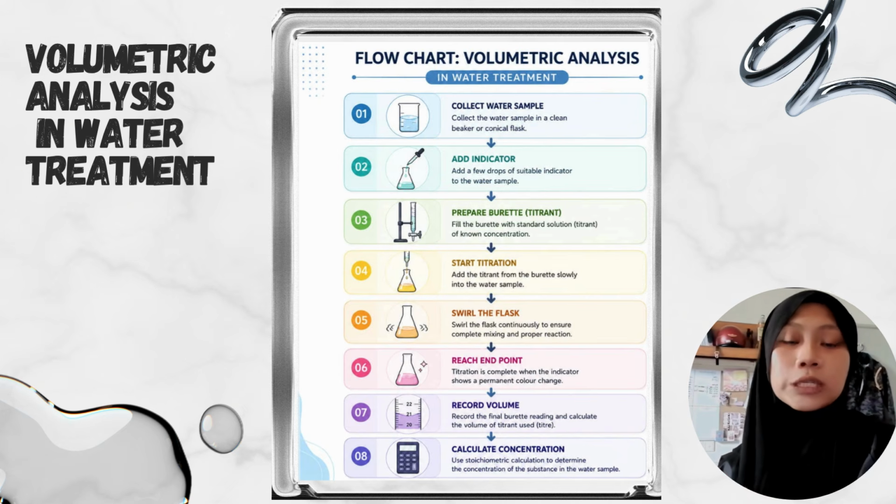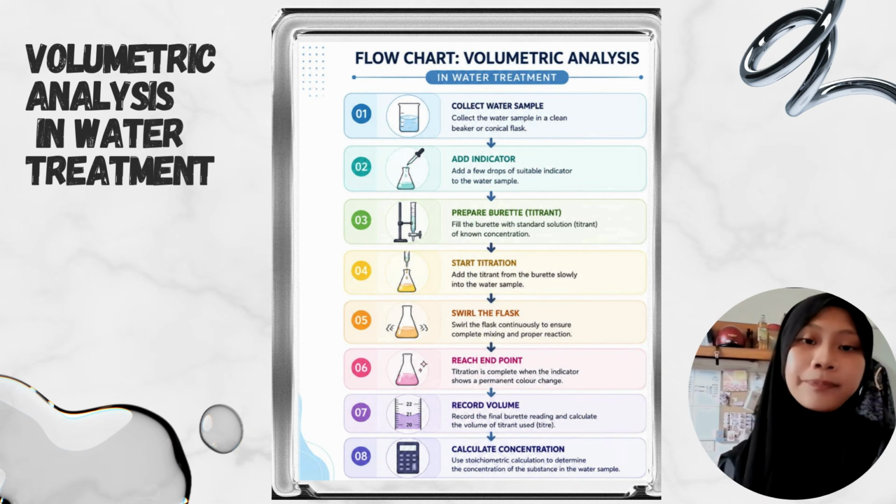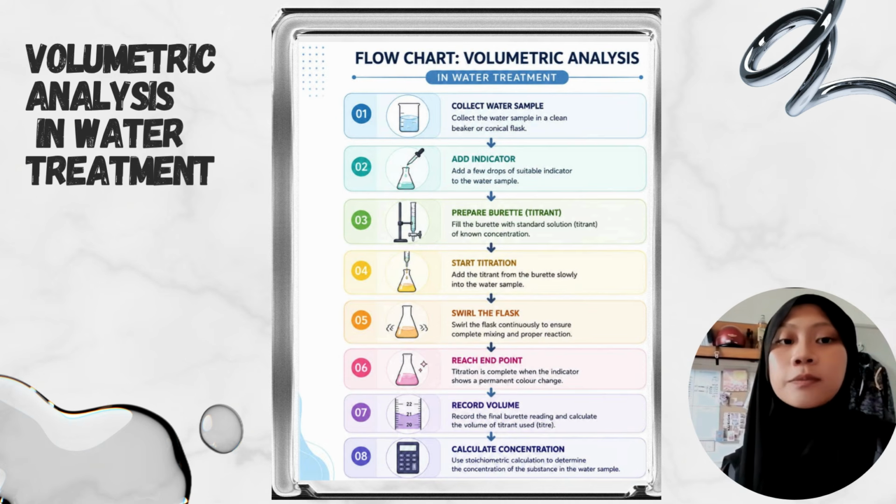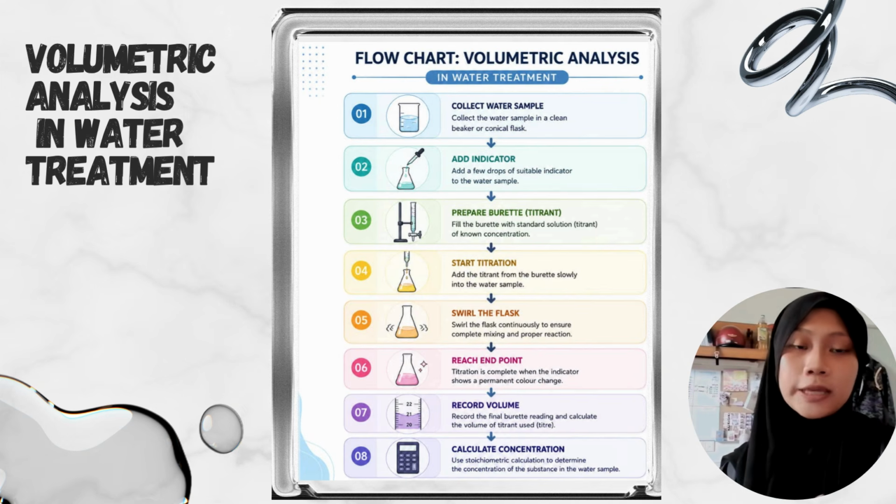Second, we need to use an indicator, a few drops only of a suitable indicator, added to the water sample. Third, we should prepare the burette, which holds the titrant. We need to fill the burette with a standard solution titrant of known concentration.